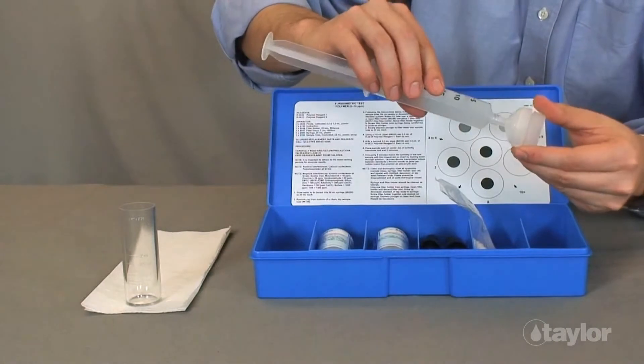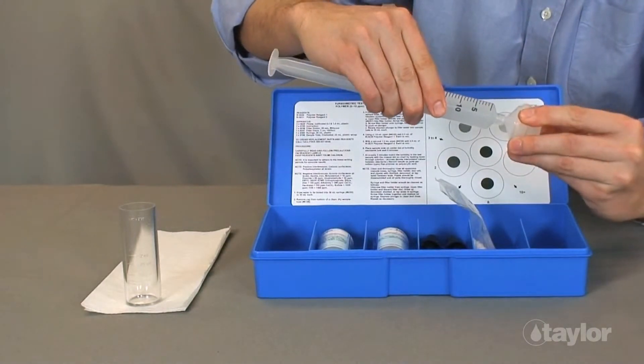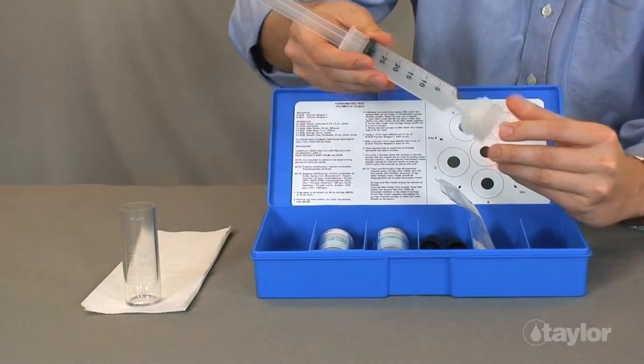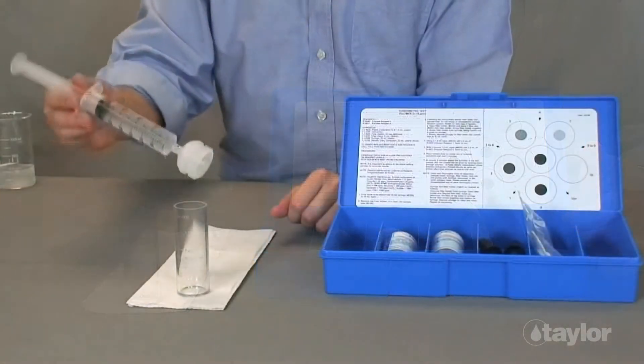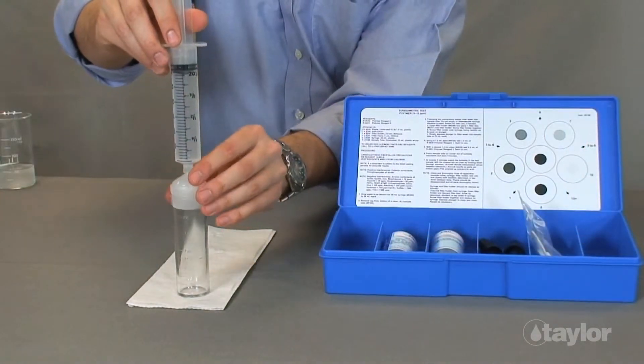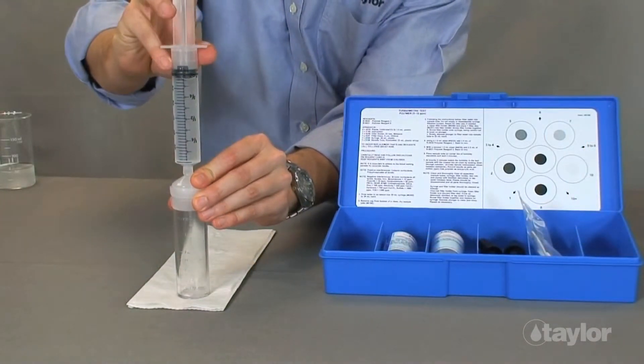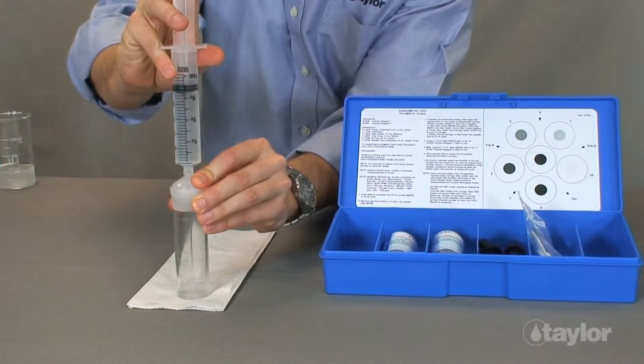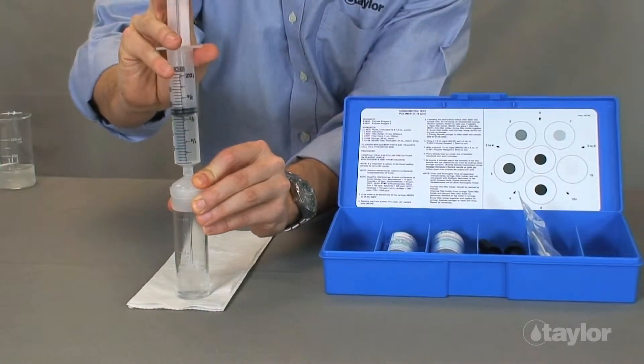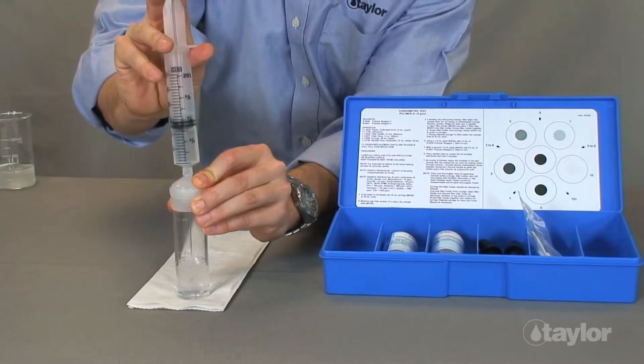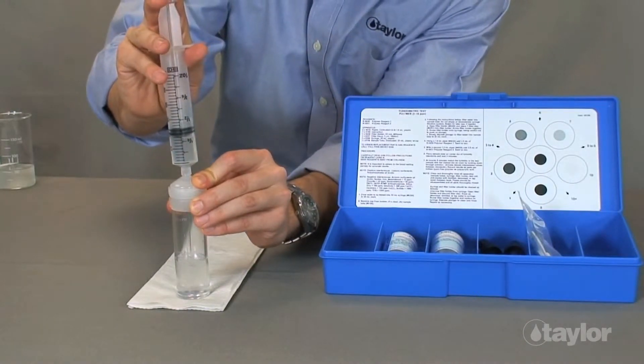Attach the prepared filter holder. As you screw the filter holder into the syringe, be careful not to push the plunger prematurely. When the syringe filtration system is assembled, you are ready to begin dispensing. Slowly depress the plunger to expel filtered water into the water sample tube. Fill the sample tube to the 25 milliliter mark.